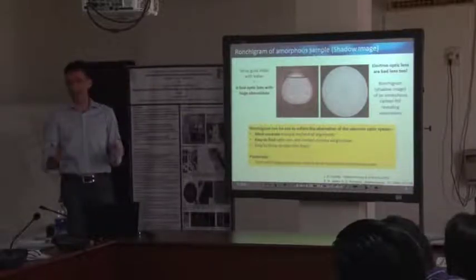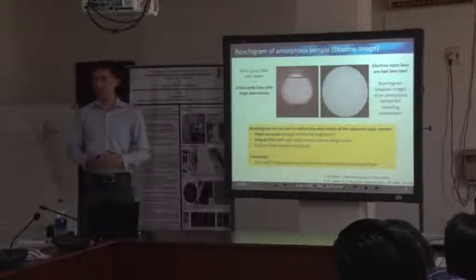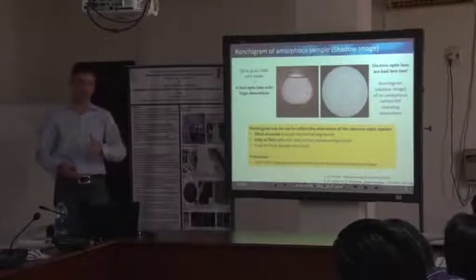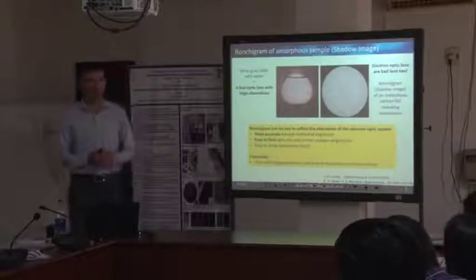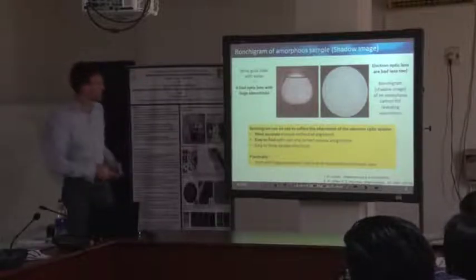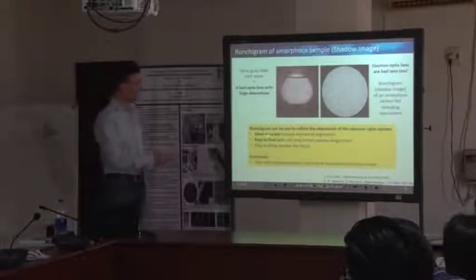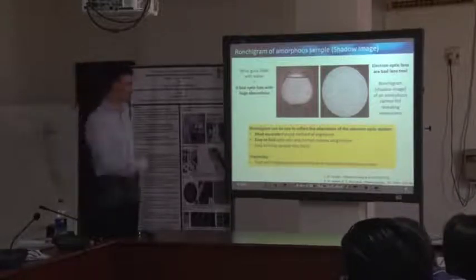To switch from TEM mode to STEM mode, if you already have a pretty good pre-alignment, you would do some of the condenser alignment in TEM mode and then switch to STEM mode. In principle, it shouldn't take longer than, let's say, 5 minutes or so. This is pretty convenient. You can switch back and forth even with older microscopes. So with this so-called Ronchigram for non-aberration corrected microscopes, we can do, I would say, the most accurate alignment of our probe for the best resolution.